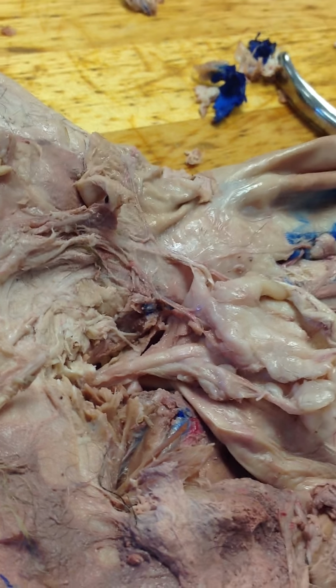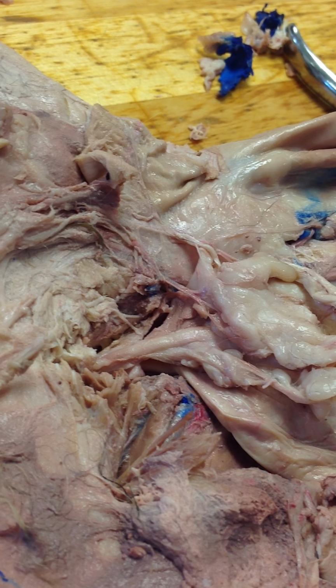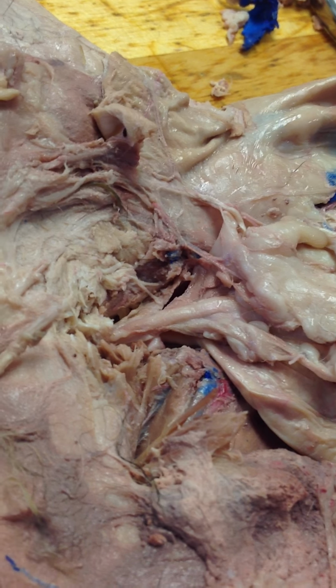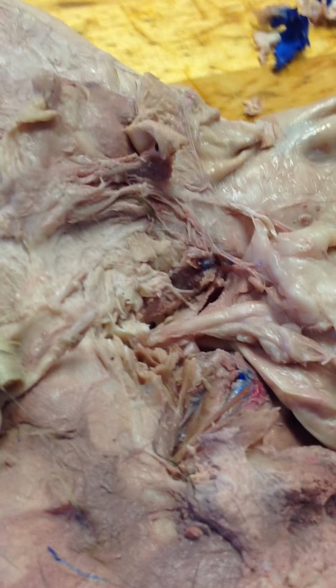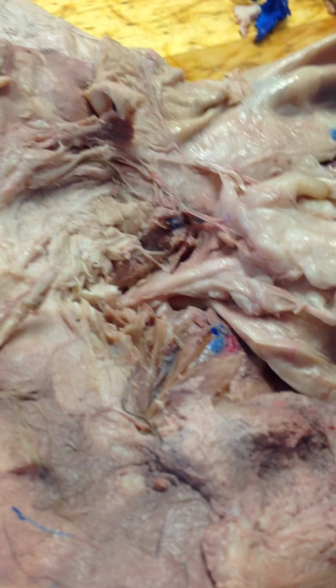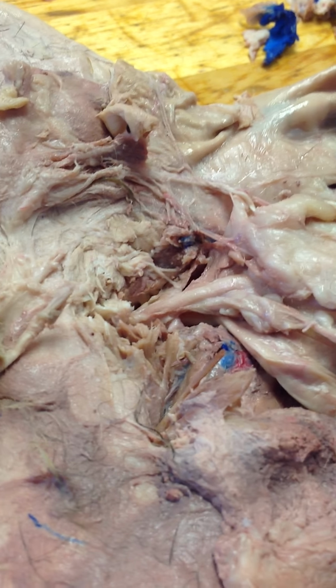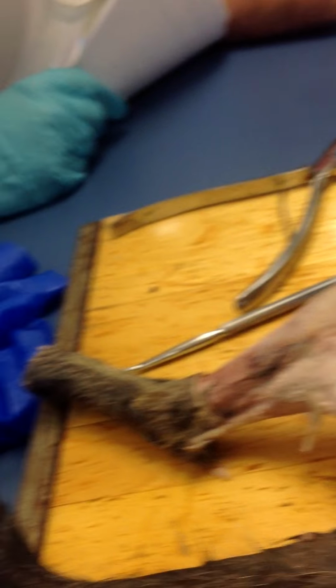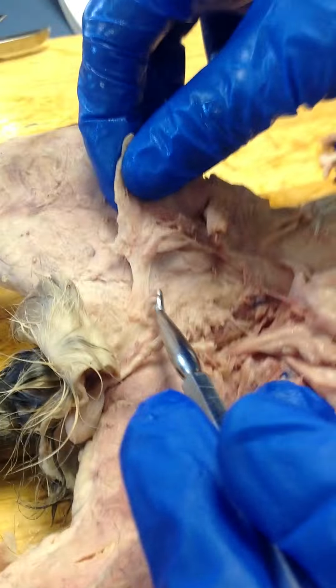Inguinal canal. What canal? Inguinal. I've never seen that word, I don't remember it on the label. Where is that? A short passageway through the abdominal musculature. Oh, so somewhere in here, where it goes from the outside into the body cavity.